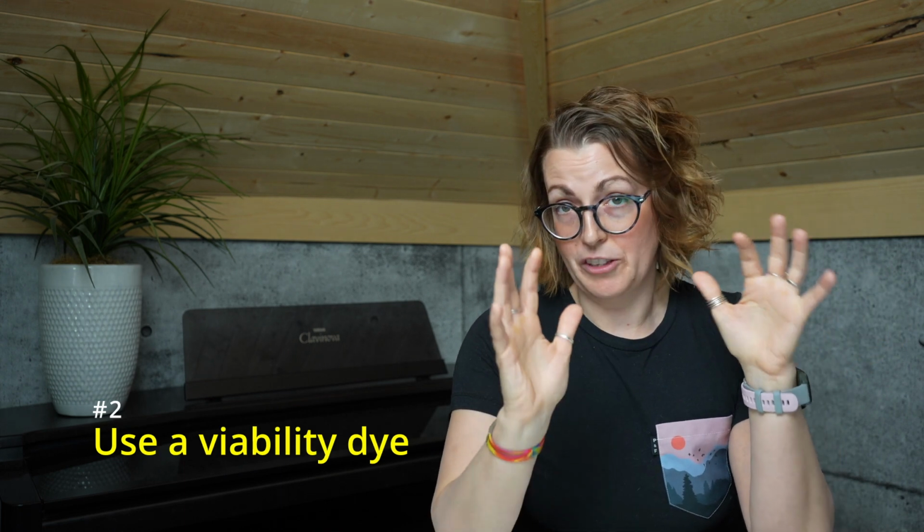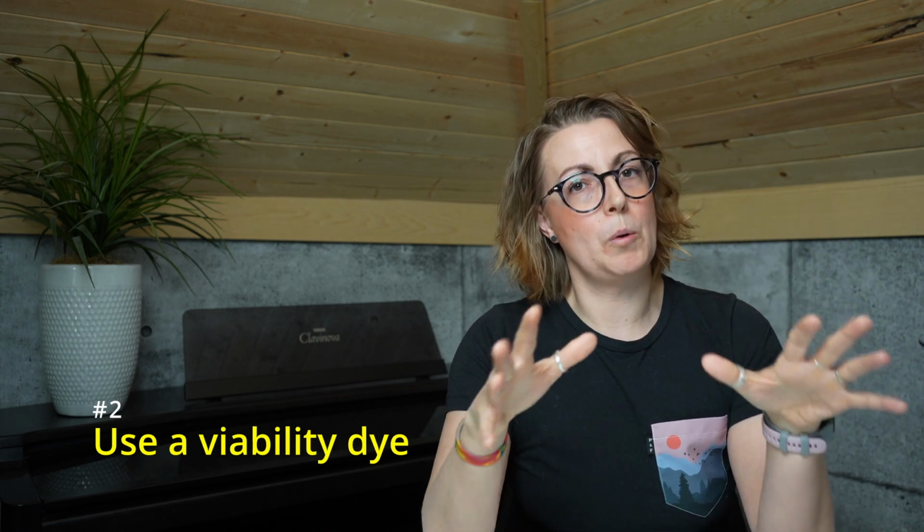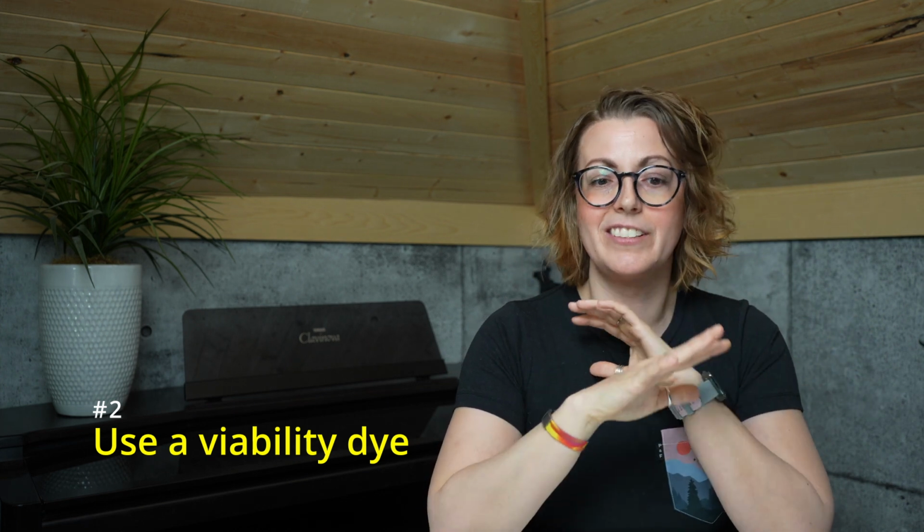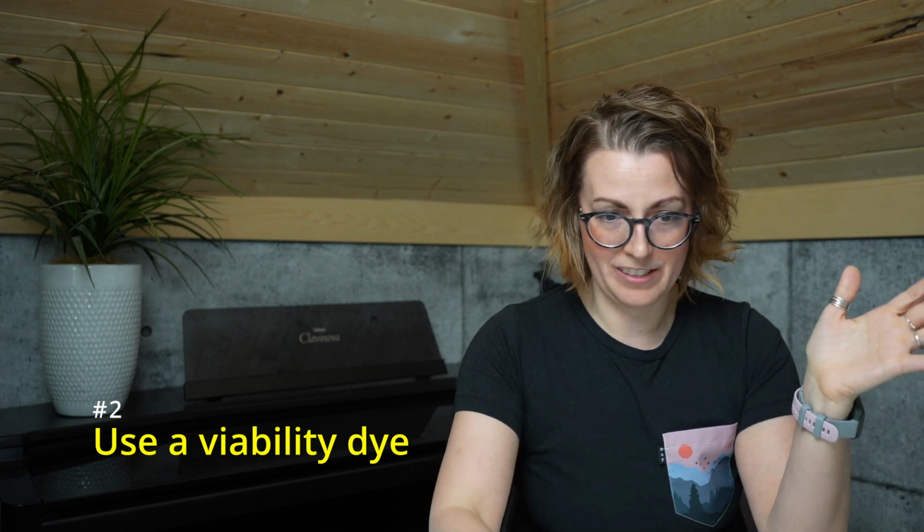Second up, you've heard me say it before, even more important on a sorter, use a viability dye. Sorting dead cells does no good for anyone.